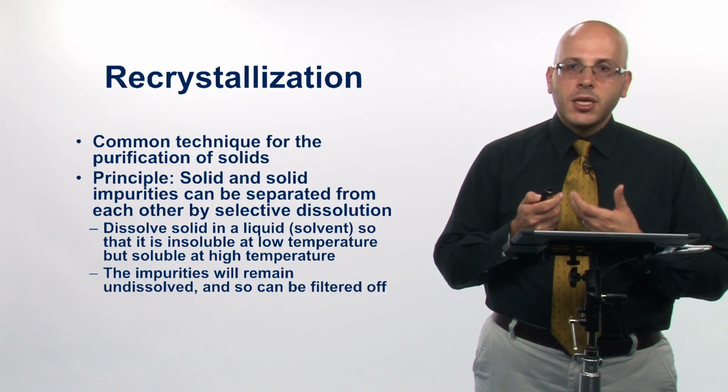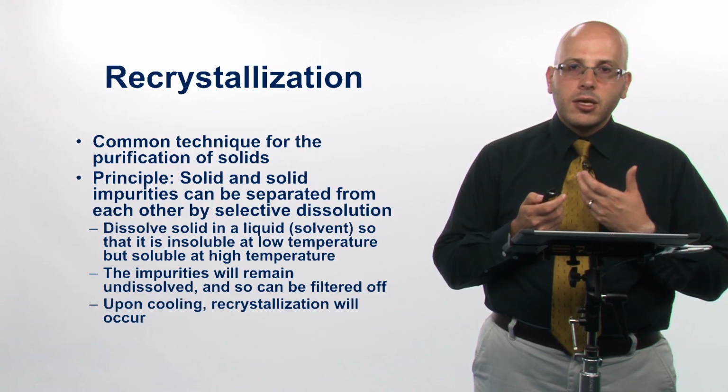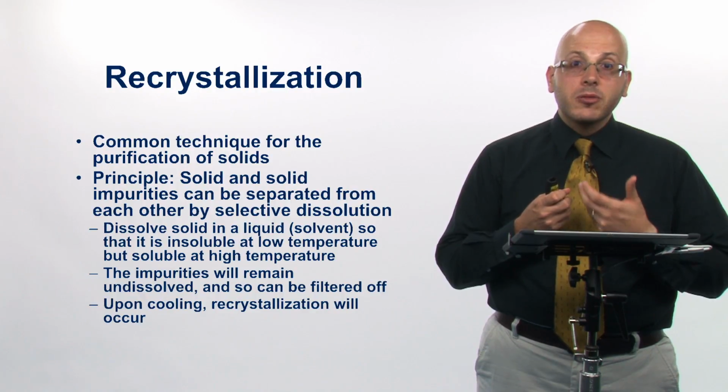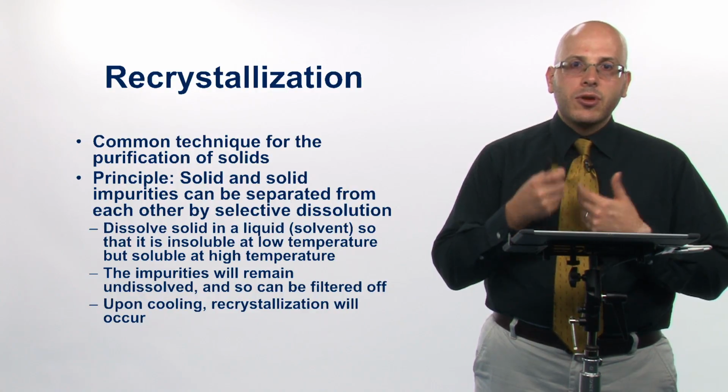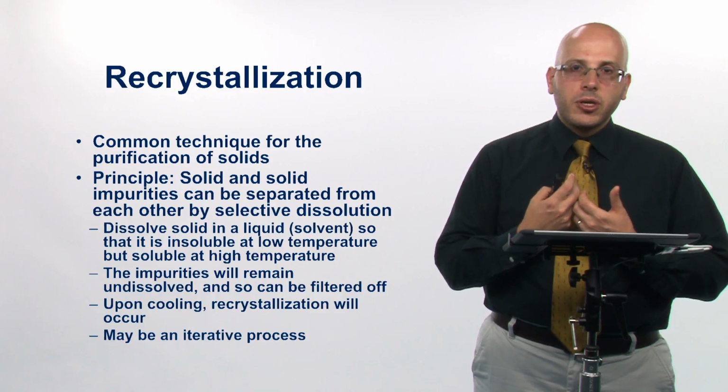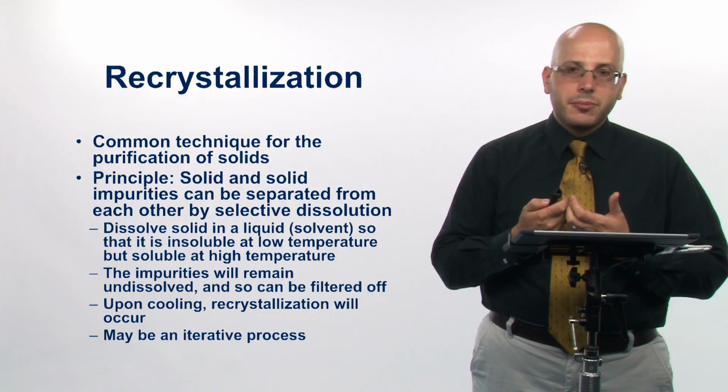And the nice thing about this is, even if the solid that I get is not 100% pure the first time around, I can repeat this multiple times. And this iterative process allows me to get higher and higher and higher purities of my crystalline material.